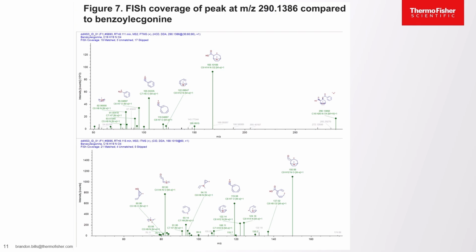So by providing it a structure and MS3, it can not only find which potential structures have the most matching fragments to the predicted fragmentation pattern at the MS2 level, but it can also take that a step further and look at the MS3 level and tell you how much of the MS3 fragments are also predicted. And that can rank your structures and give you some more confidence in your unknown annotation, even when you don't have matching library data to look at.